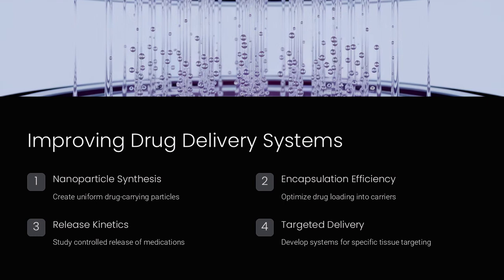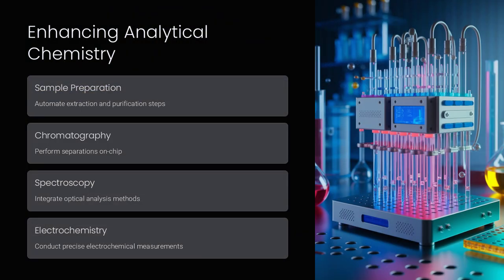Future digital microfluidic systems are being developed that use AI to optimize droplet handling in real time, adjusting protocols automatically to ensure the best possible experimental outcomes. Imagine upgrading from a traditional manually operated factory to a fully automated smart factory where machines communicate and adjust operations in real time to maximize efficiency and output.